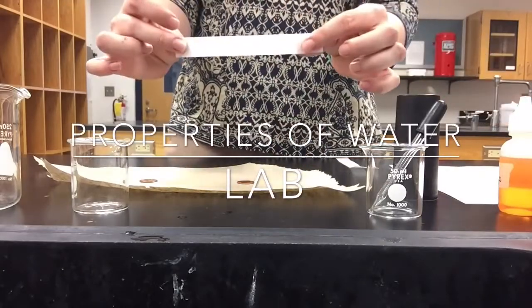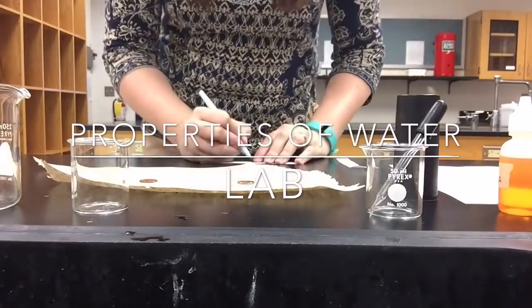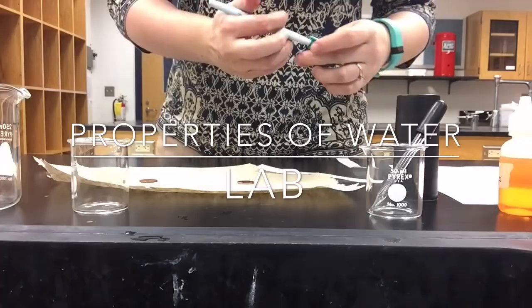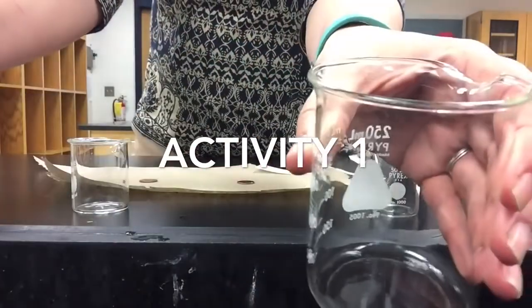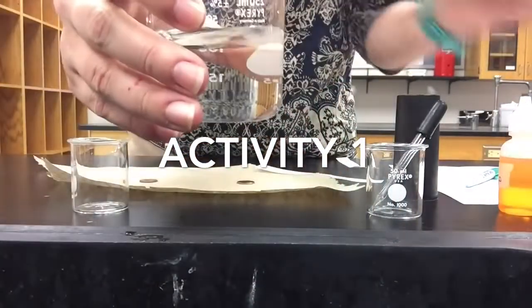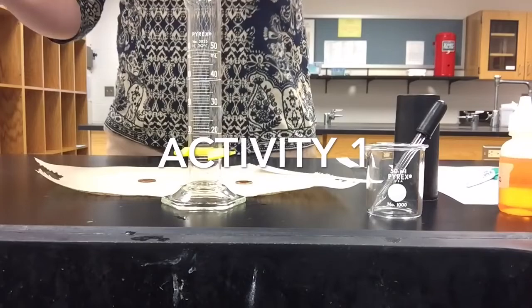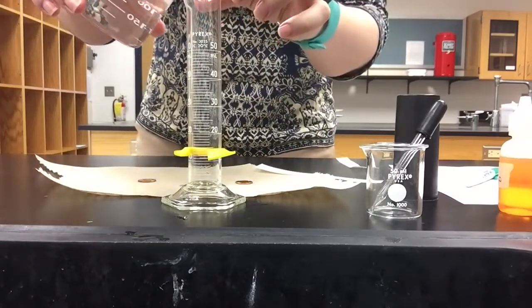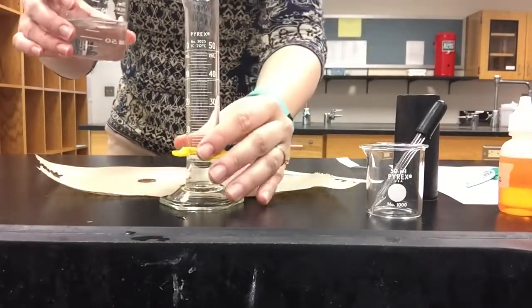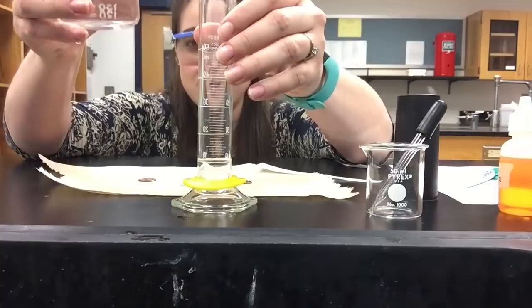First, you have one strip of chromatography paper and we're going to mark that with a green Expo water-based marker, just right down the middle. We're going to fill our 250 milliliter beaker and carefully pour 15 milliliters of water. You have to make sure you are eye-level so you can read the meniscus.